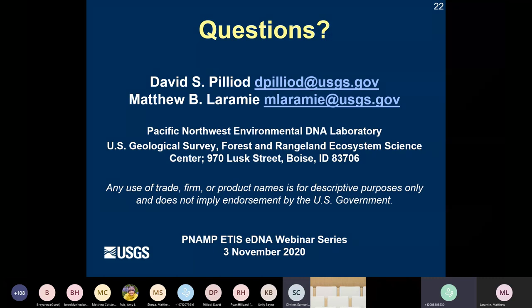Great, thanks. We have another question in the chat. Do you recommend a way to concentrate DNA that has been extracted via column kit?